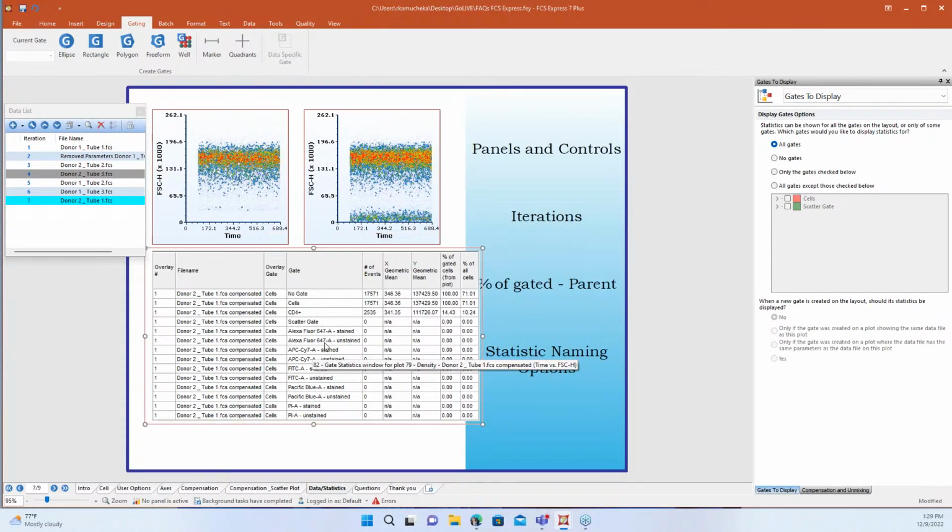So here, I apologize, I still have my compensation files here from when we were looking at that scatter gate and making a data specific gate, but I have a CD4 gate here. Now this percent of gated from plot is relative to that cells gate. So our statistics will always reflect the relationship to the population that's being displayed on the plot.